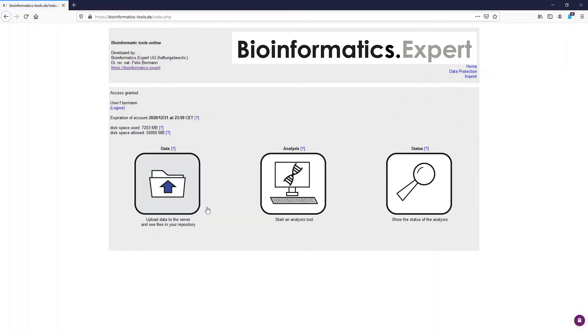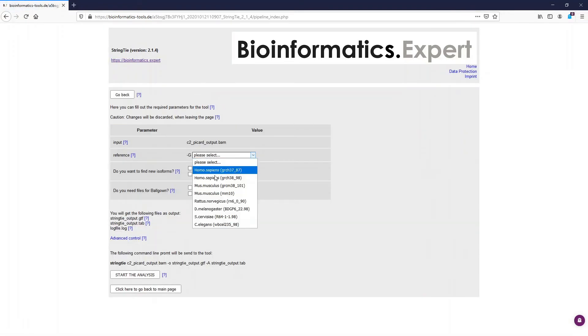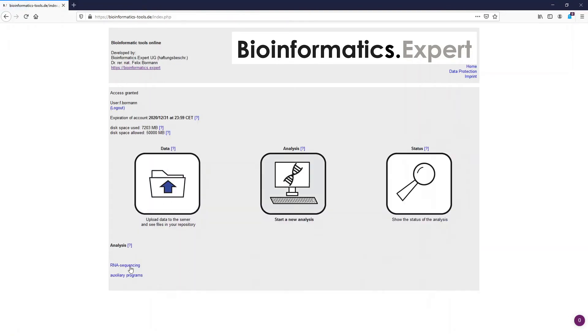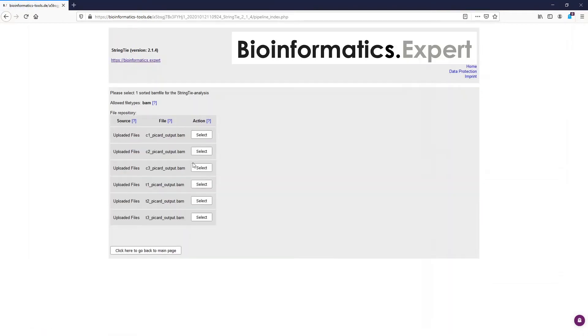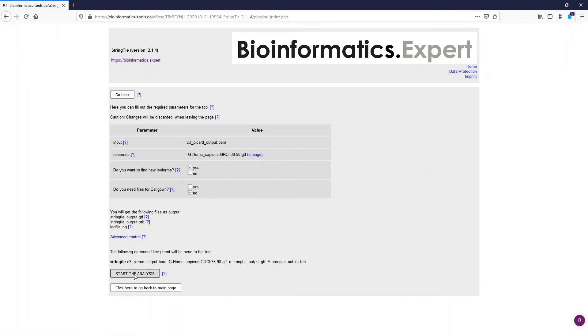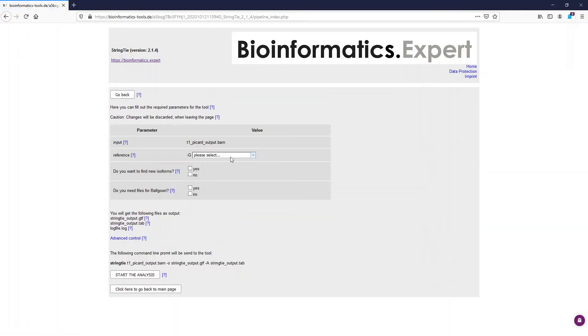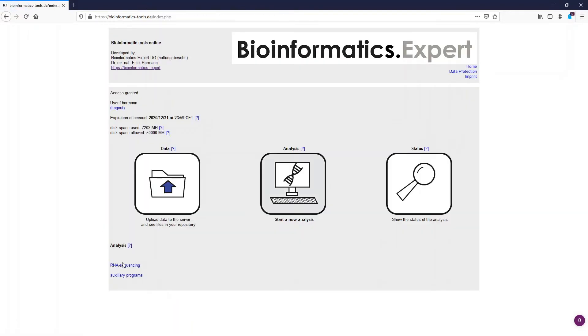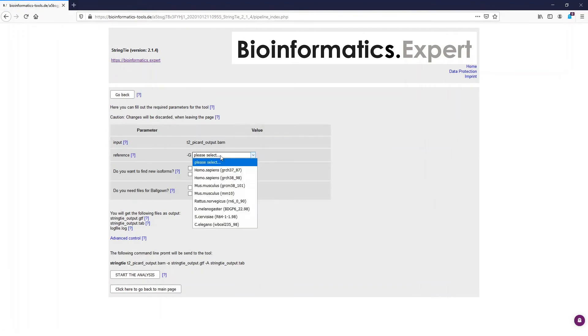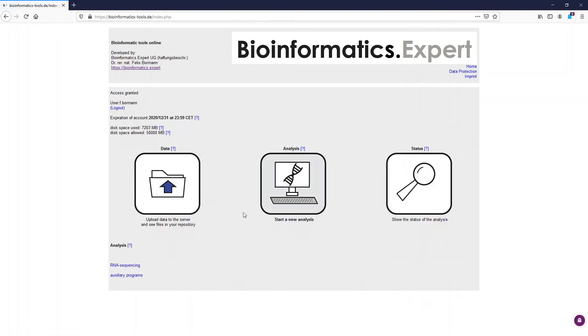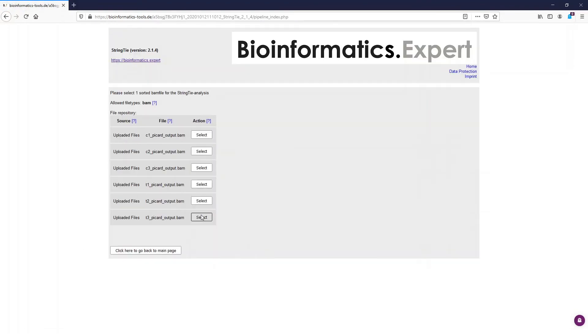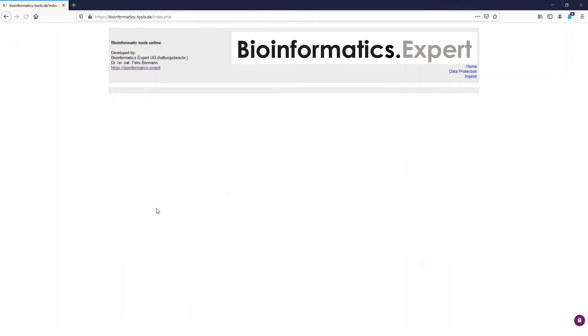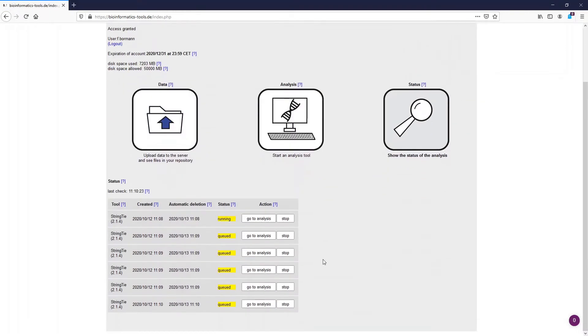Let's start also StringTie for the other files. So I accelerate this step a little bit. And now we skip the waiting time until the analysis has finished.